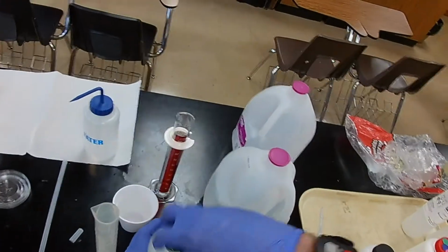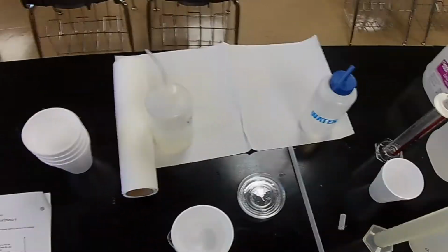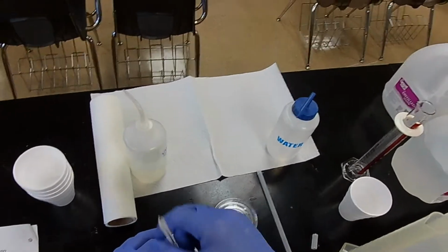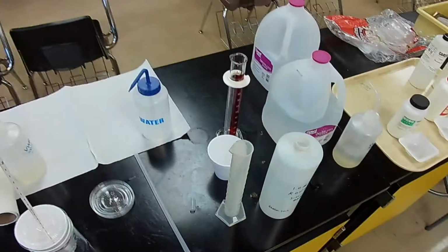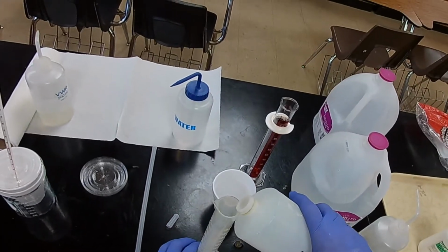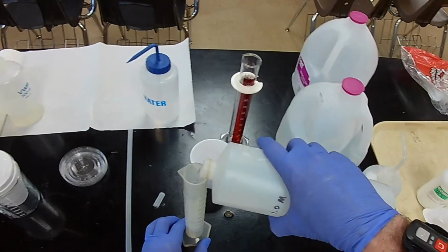So now let's make up the potassium hydroxide. And we need to be measuring the temperature here. I'm not going to fasten that real tight because I want to be able to remove it quickly. We're going to get the initial temperature, and the initial temperature for both of them should be equal. We'll find that out in just a minute. But we need 50 milliliters of potassium hydroxide. So let's measure 50.